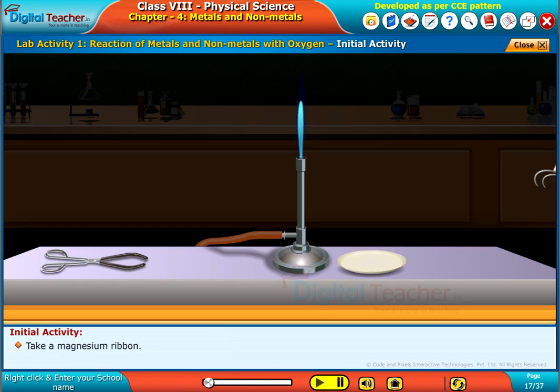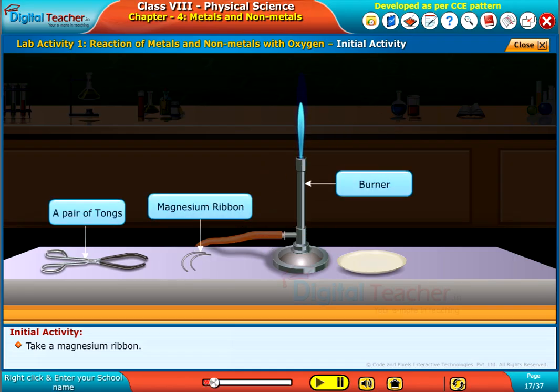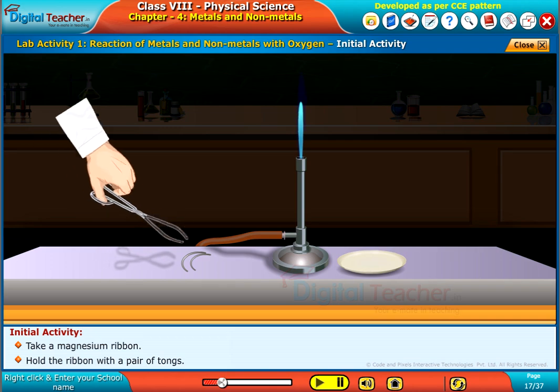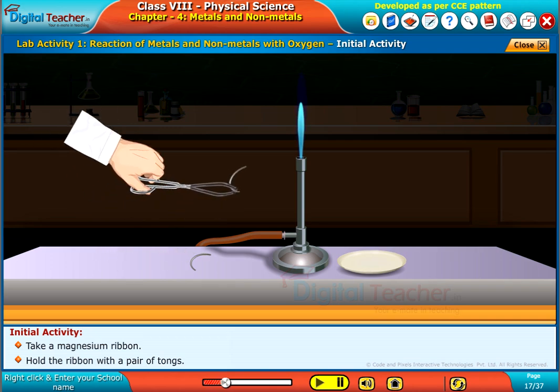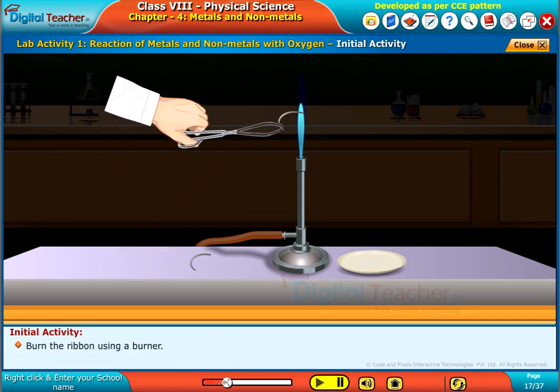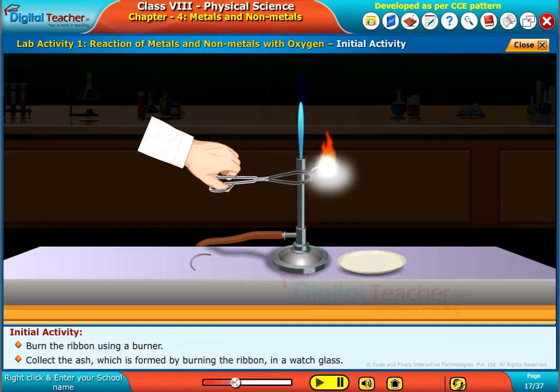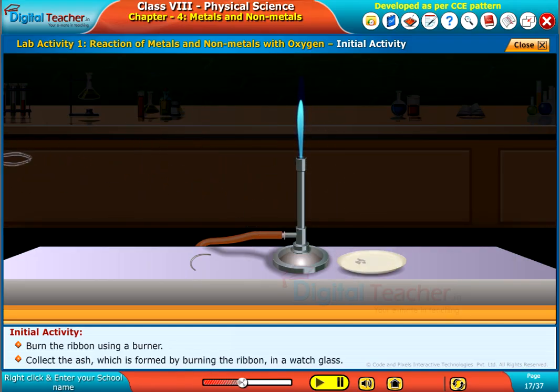Take a magnesium ribbon and hold the ribbon with a pair of tongs. Burn the ribbon using a burner. Collect the ash which is formed by burning the ribbon in a watch glass.